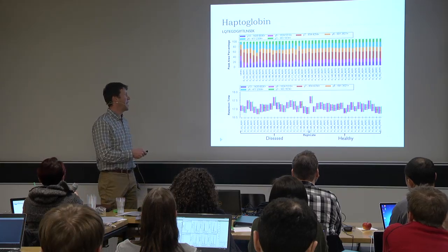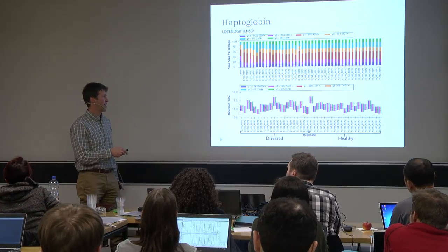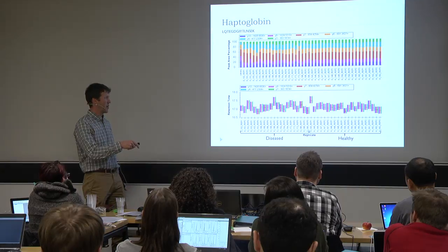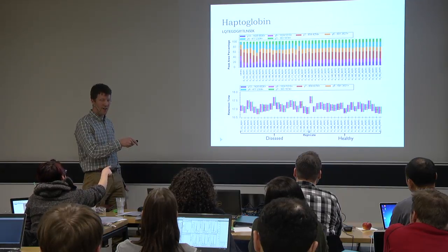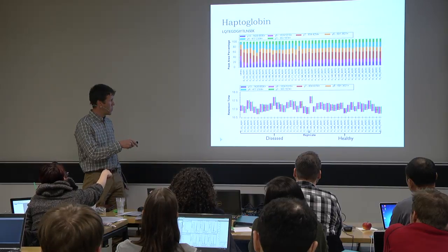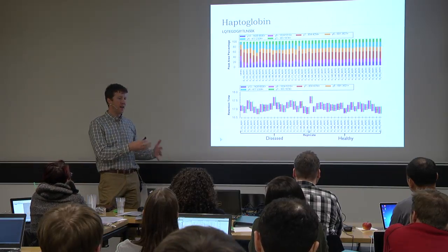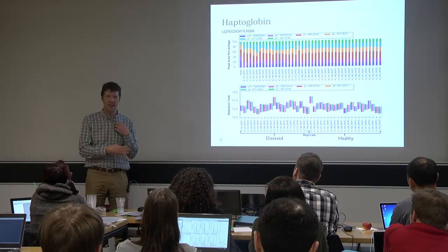Oh, okay, that's kind of interesting. So she's saying there's variance among the retention times here, but also if you look at the transitions, I think you're saying. No, the replicates. If we consider replicate 1, 2, and 3 of each subject, the retention time is changing.